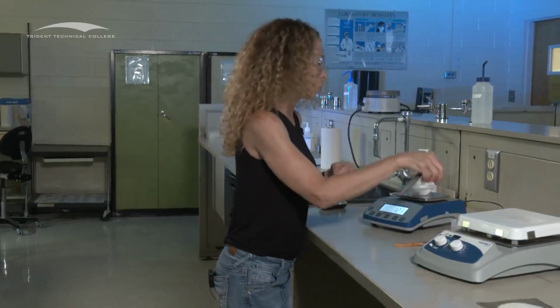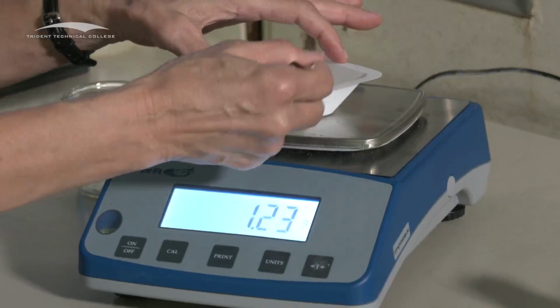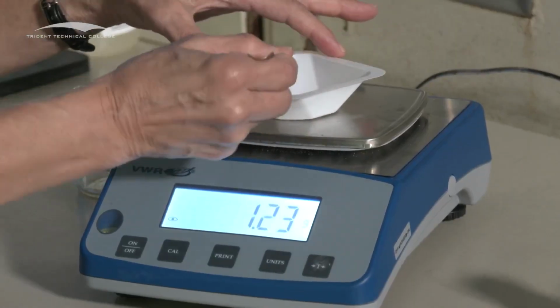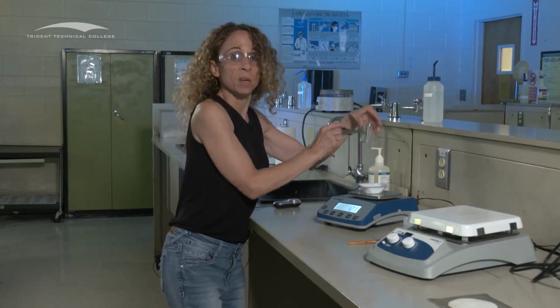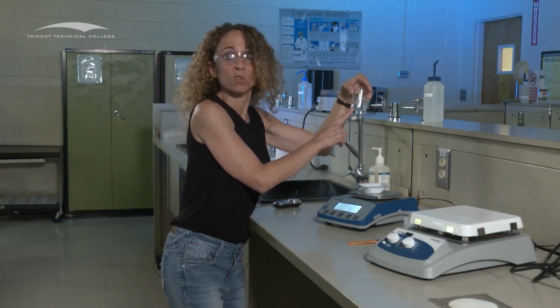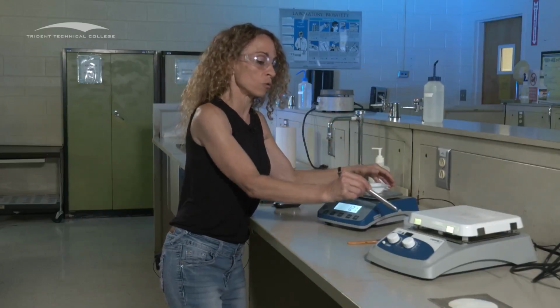Do not do that. What you're going to do is get another container, take it out, and bring it back to 1 gram. Done. And then you will dispose of any excess according to the directions that are in your lab manual, okay? But do not put any extra back into the bottle.